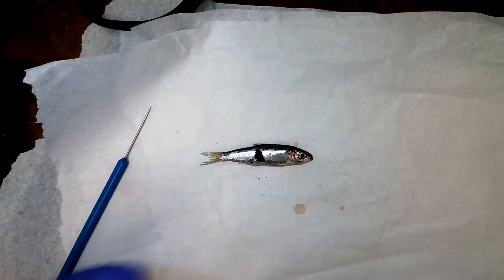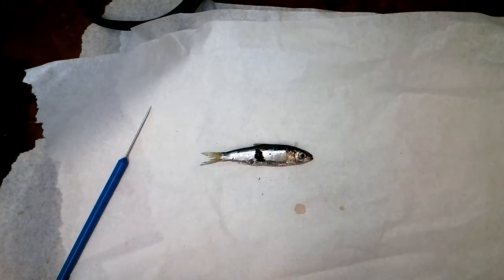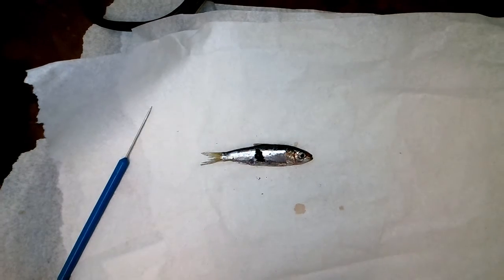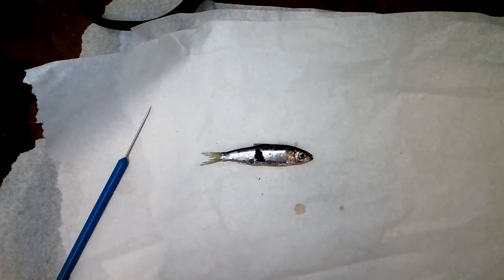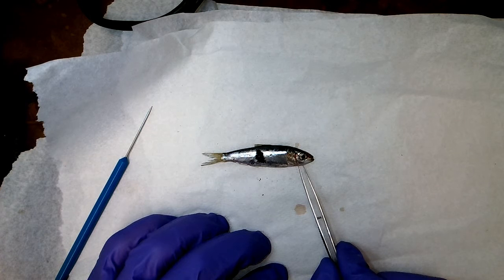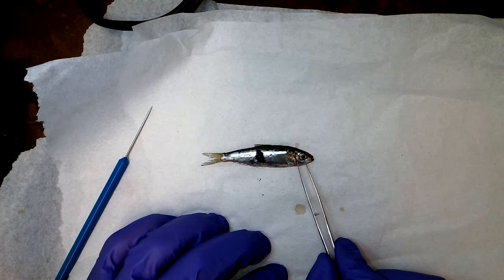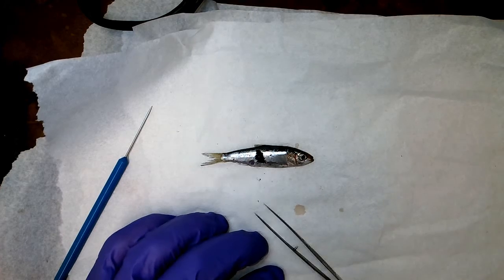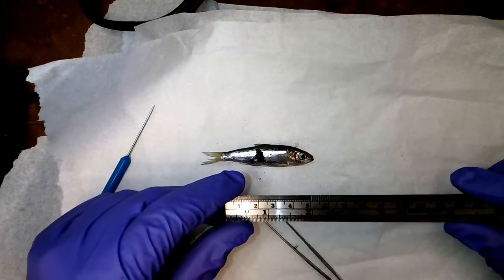Now you can go ahead and measure those depths if you want, or eye them up. It is pretty helpful to make measurements. Again, you're looking at the cheek, this portion right here. So I'll go ahead and measure this for an example.